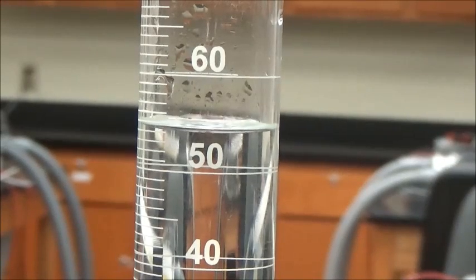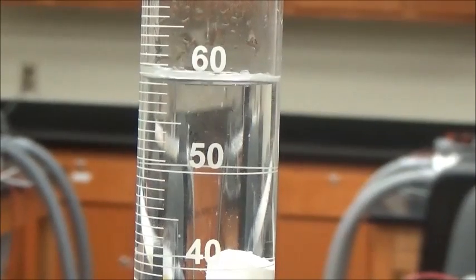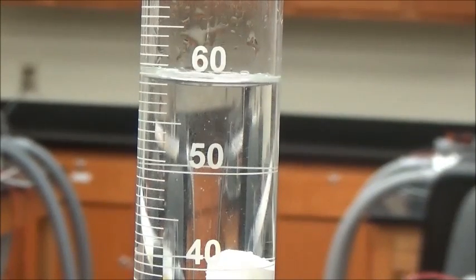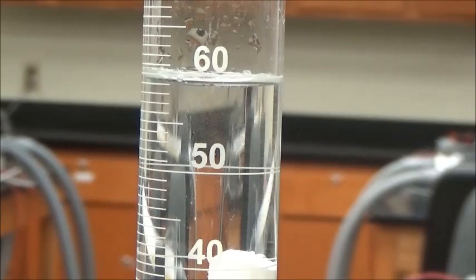So what I'm going to do is take our piece of chalk and drop it in there. It is now at 59 cubic centimeters, or is it? Let's see. Yep, that's 59 cubic centimeters.